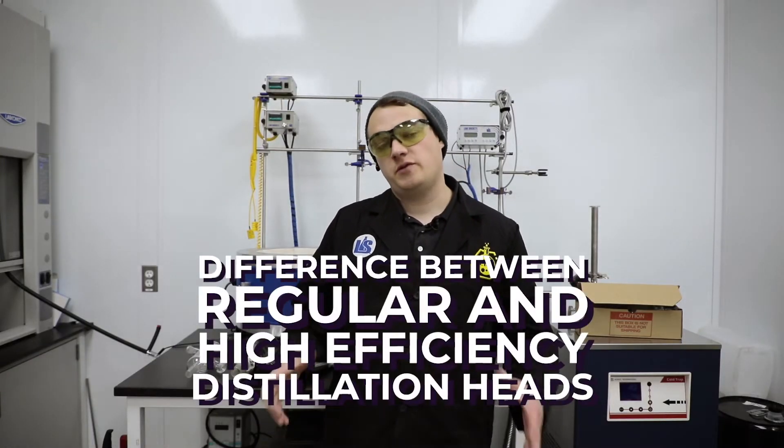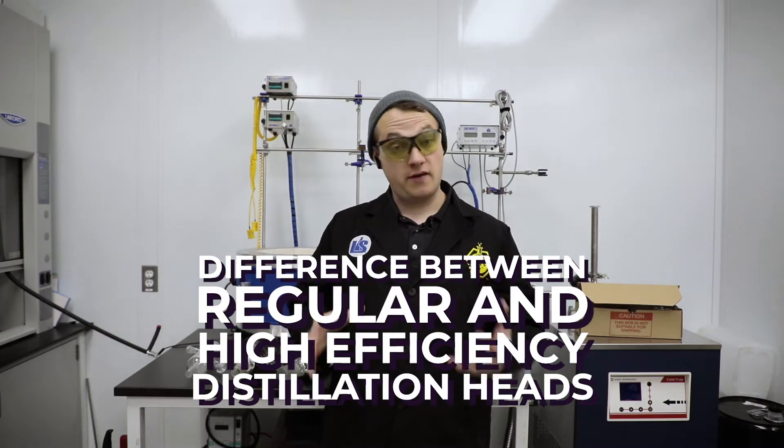Happy Wednesday! This is Mike here from Lab Society, and today we're going to talk about the difference between regular distillation heads and high-efficiency distillation heads.